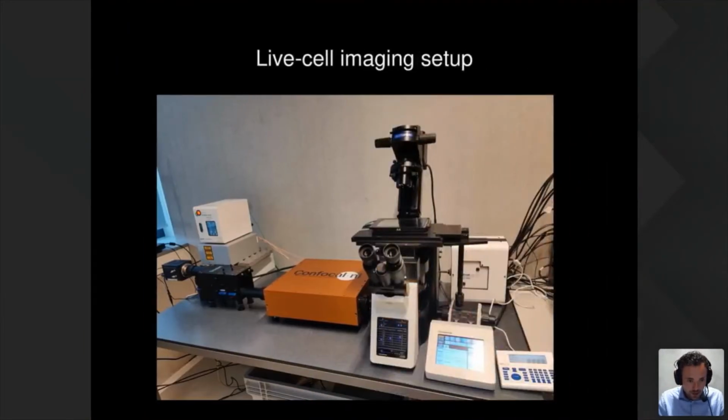And then we have the setup which I used to image this neuron. Here you can see an Olympus IX83 with a cool LED as wide field illumination system. To the left of that you find the RCM attached to the multi-split and a Hamamatsu Flash 4 detector. On top of that, there is a stage top incubation system from Tokai Hit, and below that we find the Toptica 4-channel laser combiner. Today I'm going to show you a similar platform. One of my last slides shows the platform I'm going to use today for the acquisition.